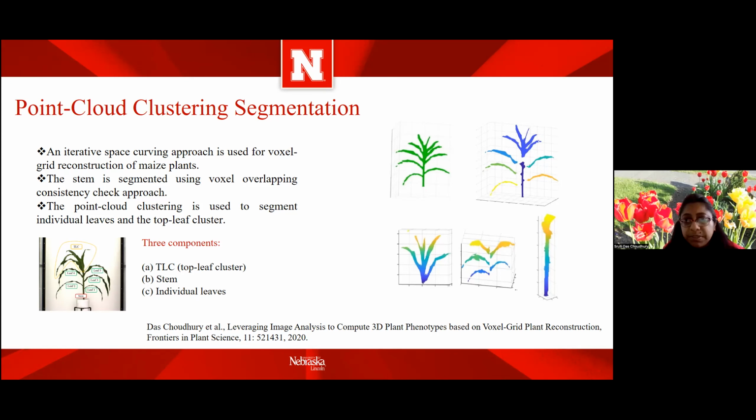But what happens if we find the total number of cross-sections more than 1, that is 2? So we are finding 2 cross-sections on the upper level. It means there is a presence of a leaf attached to a junction. And this holds true for maize plants because we know in maize plants, the leaves grow using a bottom-up approach in alternate opposite fashion.